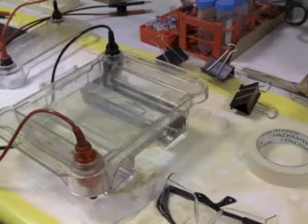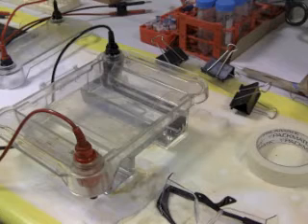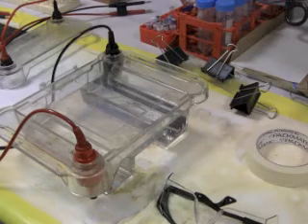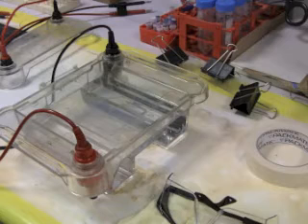Once your gel has finished running, you will need to reveal the DNA. You can't actually see the DNA in the gel, so you're going to have to reveal it. We do that by staining the gel. The stain binds to the DNA and you can then put it under UV light, and the UV light reveals where the DNA is on the gel.